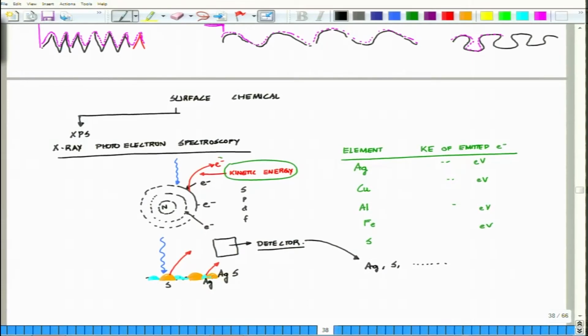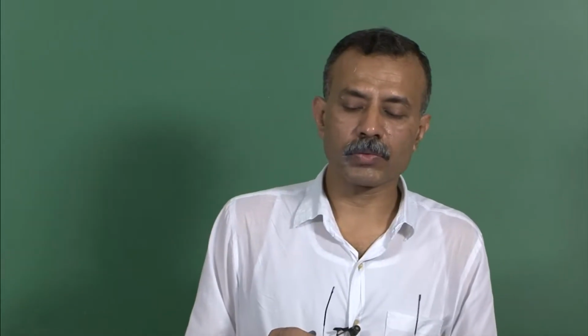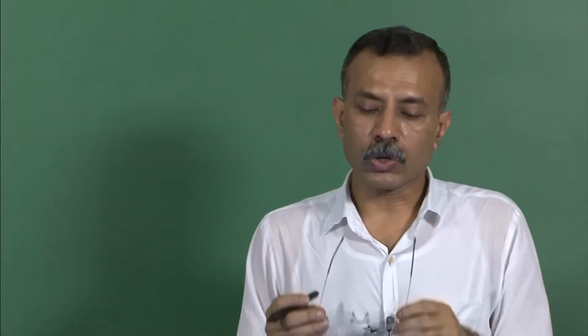This is the fundamental, and based on this, I want you to see any literature available online on X-ray photoelectron spectroscopy. But the fundamental of it is this, and it is one of the most powerful surface characterization techniques.